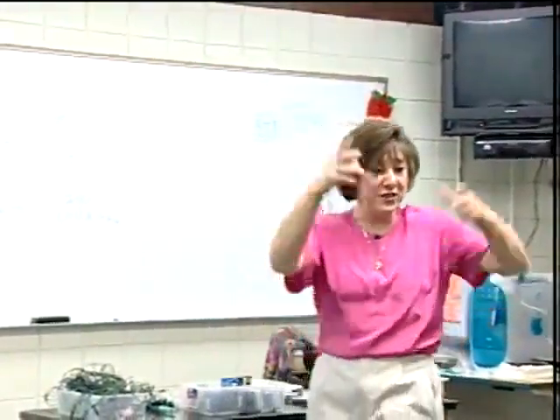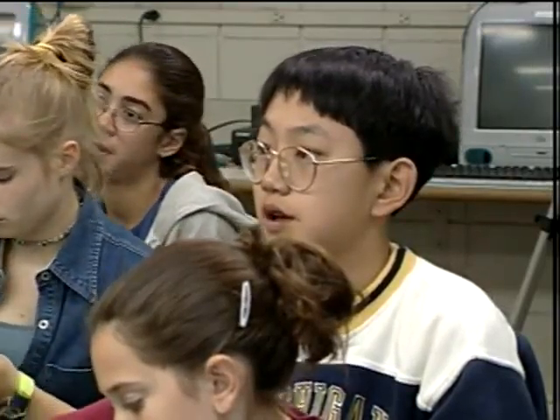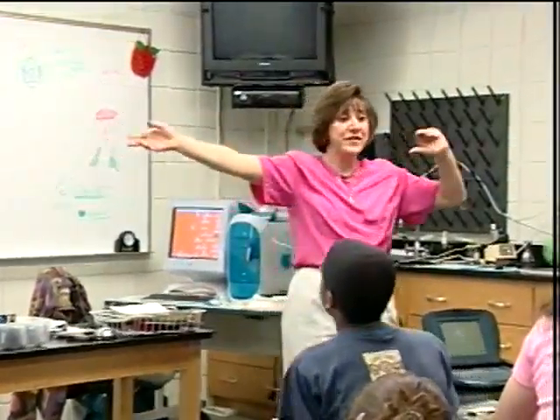Okay, so Robert, continue. I'm going to use the substance. Thank you. Then it'll give you a reading of volts, and you have to set like this many volts equals the pH of this. Like, say you know the pH is like 11 or something, and it gives you a reading of volts. You'd have to set it so like this many volts equals 11 for pH. Okay, exactly. And that's just from one end. So maybe I've set my basic end, and what about the other?